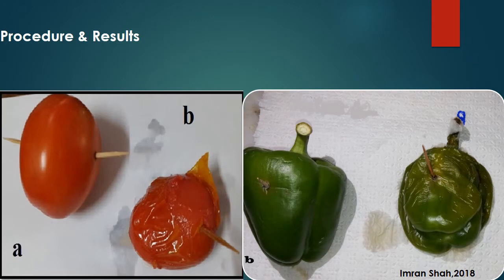This is a very simple experiment. You just need a fresh, healthy tomato fruit which is inoculated with a toothpick that was initially dipped in sterilized distilled water. This fruit acts as a negative control and under ideal conditions it remains free of disease. In another tomato fruit of the same size and shape, a toothpick first dipped in bacterial culture is inserted, and you can clearly see the destruction of the cell wall and the discharge of liquid material.